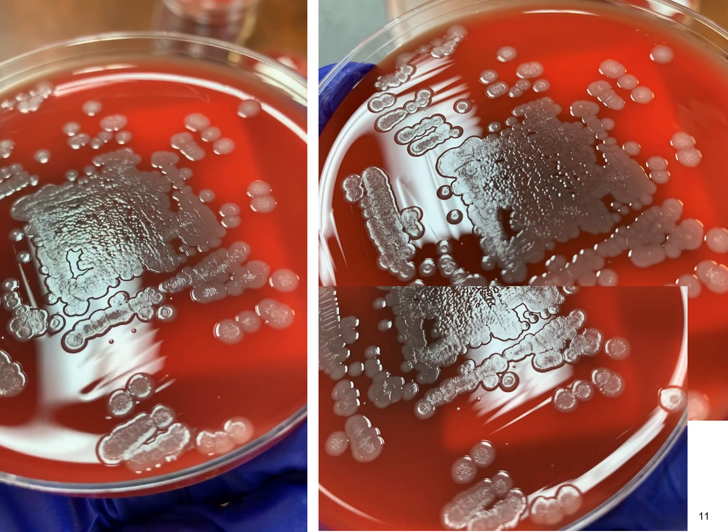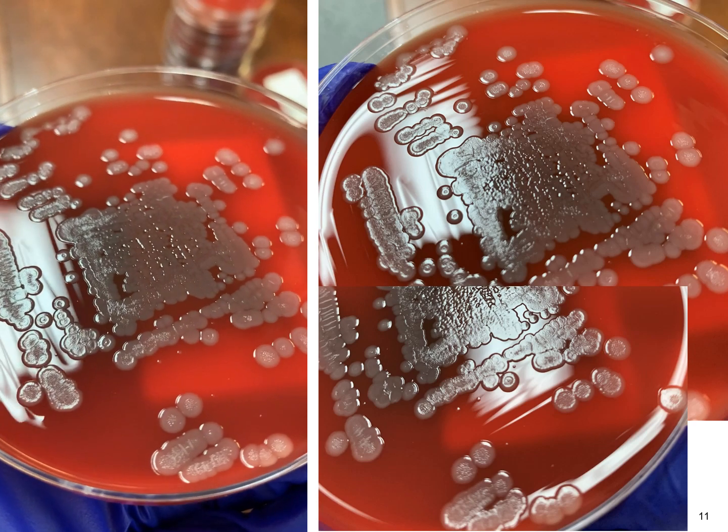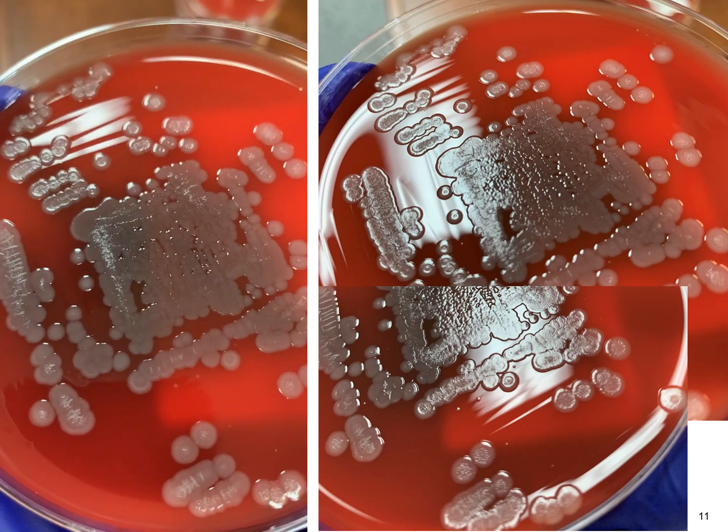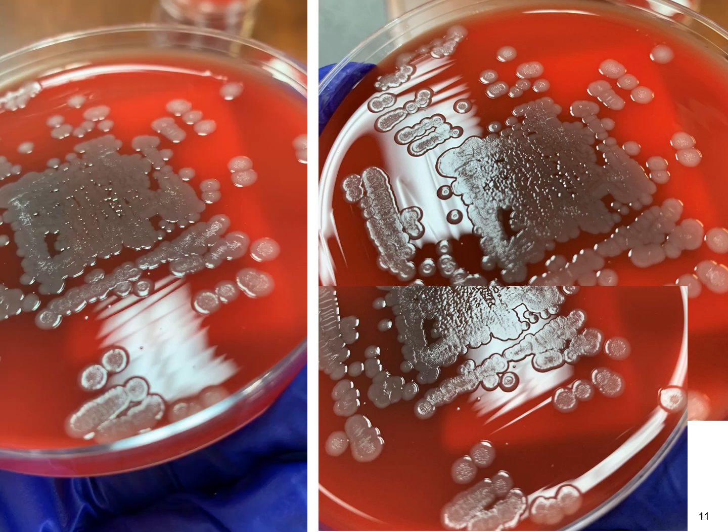So here you have an organism that they said was a gram-negative. They couldn't remember what it was. It has a little bit of a different look because you can see a little bit of roughness to it, sort of dry looking. But what's unique about this, which is sometimes hard to see, but you can kind of see here in this bottom image, and this is what I want you to see, is where it's kind of pitting back down inside of itself.